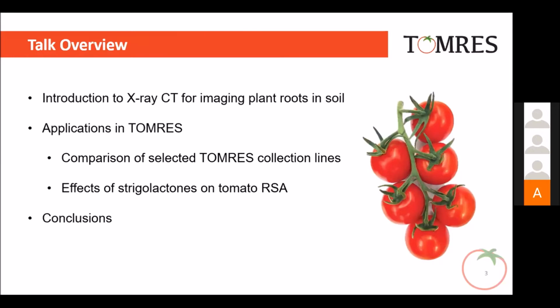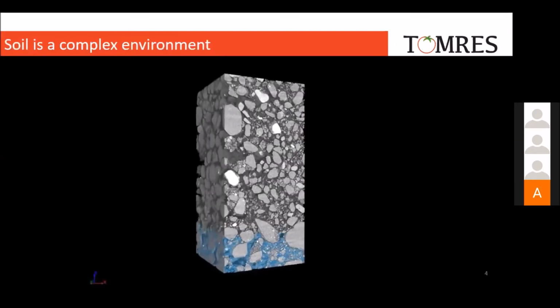Within the talk today, I'm going to give you a bit of an introduction into the use of X-ray CT for imaging plant roots in soil, and then give a few examples of applications within the TOMRES project. My background's more towards the soil science area, which is where I started using the X-ray imaging technique. So it'll be a bit more of a technical focus on the technology rather than plant biology, which I'm not so strong on.